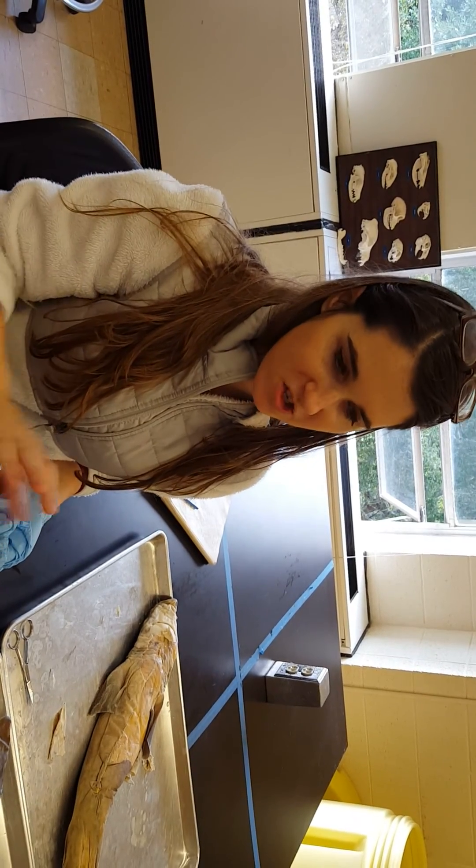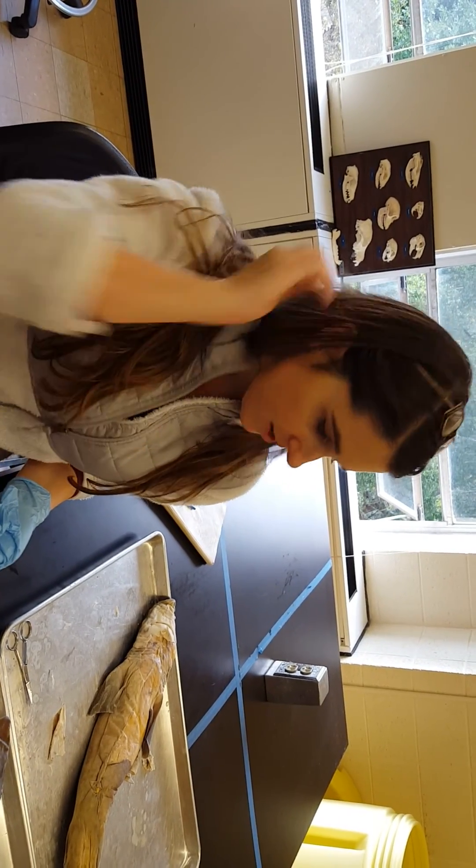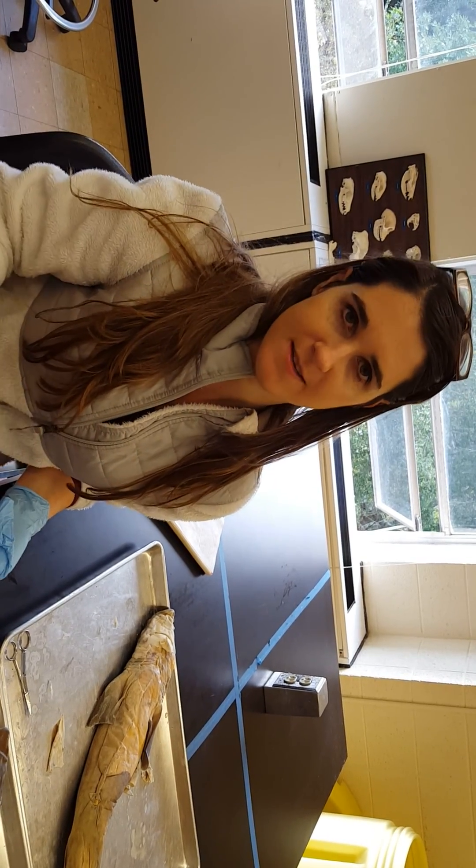This is pretty much all you need to know for the shark. Still study your manual because there might have been a few things I've missed. We're going to do the necturus in a separate video.